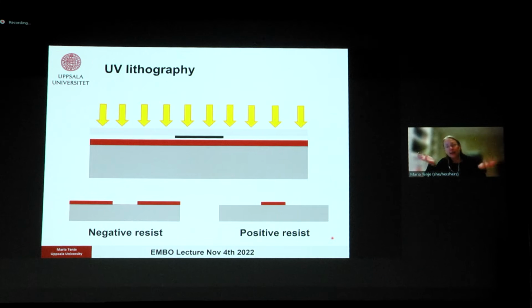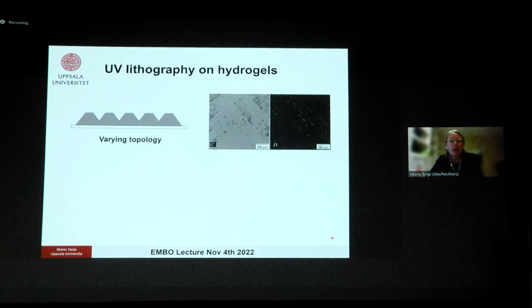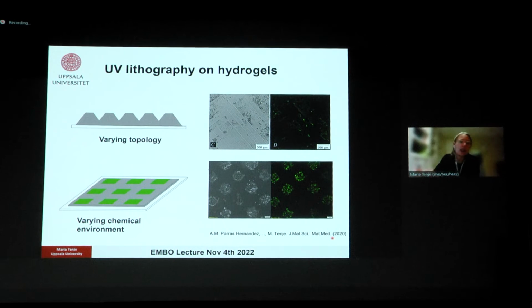Which approach you use is rather a matter of preference and how you want to modify your gels. But you can then use this technique either to vary the topology, to actually form different heights. On the images here, we have just fabricated some simple squares, and we could see that the cells were sitting on top of these structures. Or you can use the method to chemically functionalize certain areas so that the cells will adhere there and not in others.